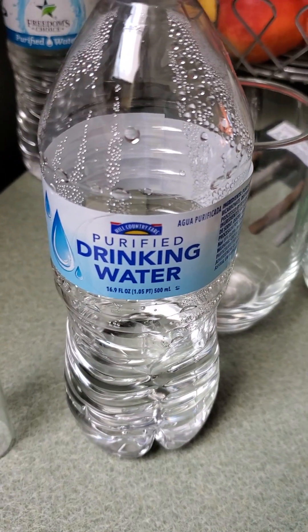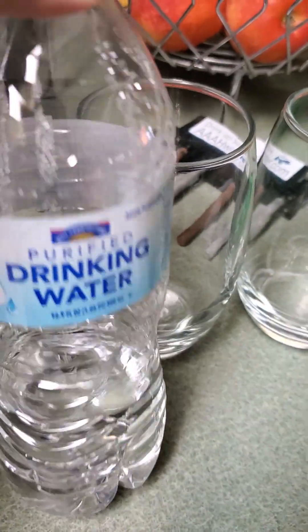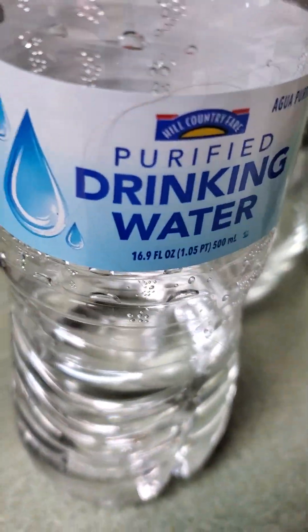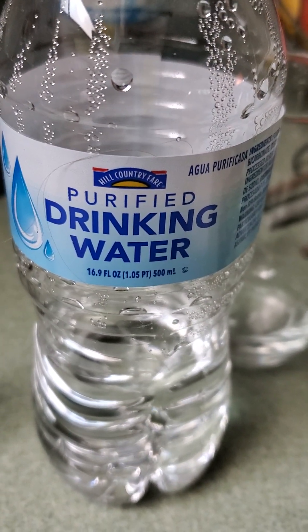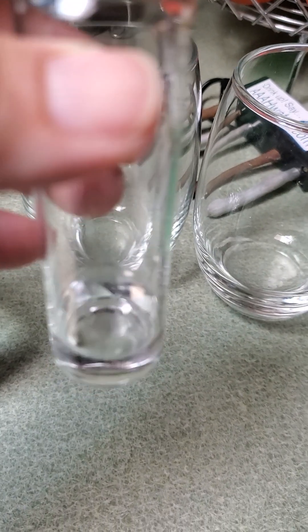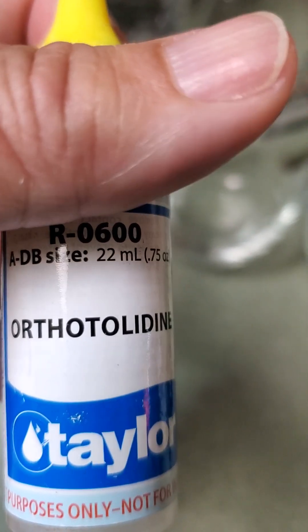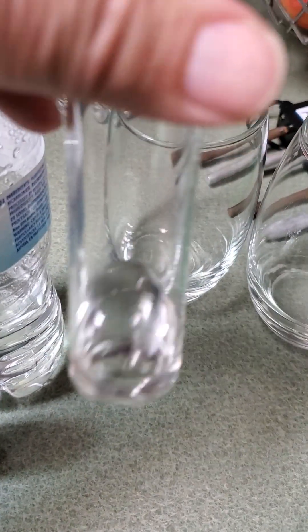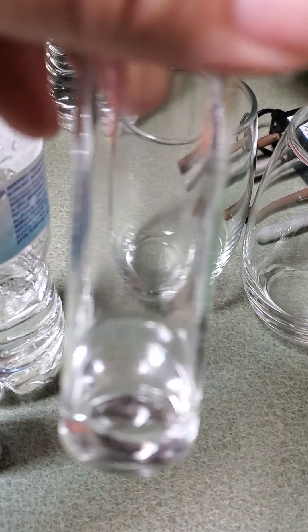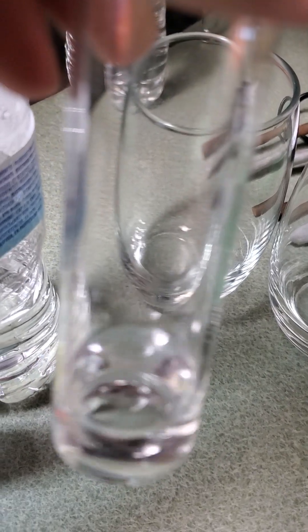We're going to run a few tests on this Hill Country purified water. As you can see it's not a full bottle, so it may affect the chlorine test because chlorine is a gas — it may have evaporated. I placed a small amount of water in the bottom, about half an inch. I've added five drops of the chlorine testing solution and it is still clear. Hopefully Hill Country has run it through at least a carbon filter to remove the chlorine.